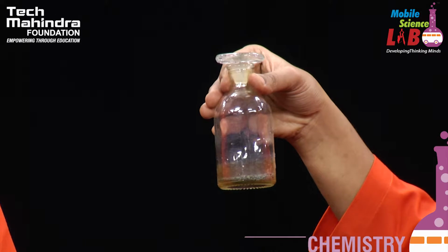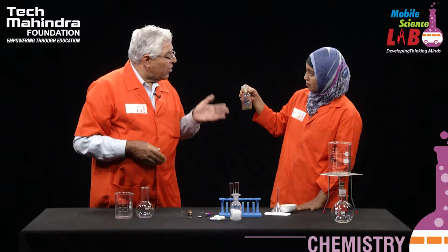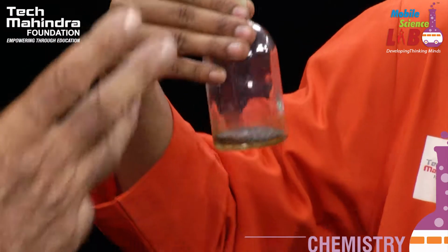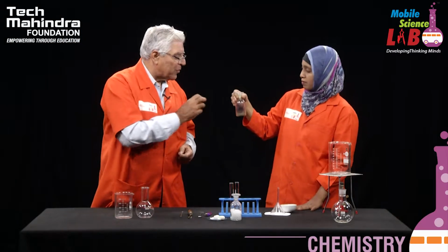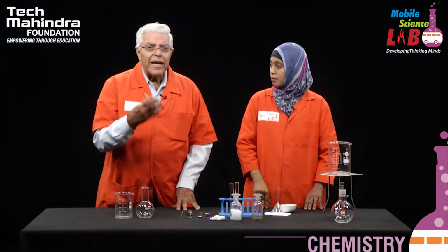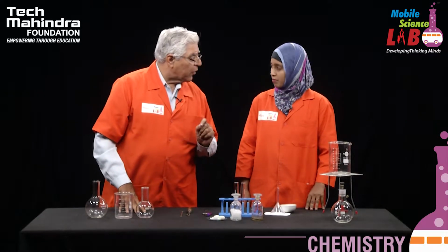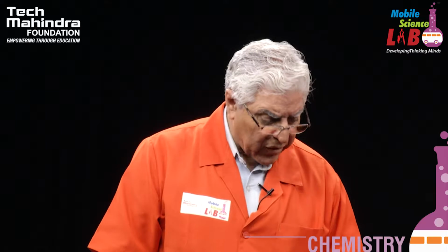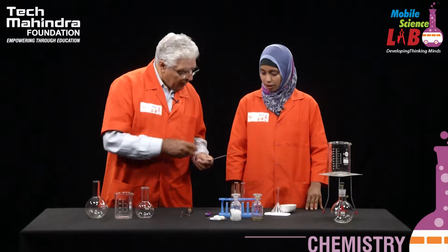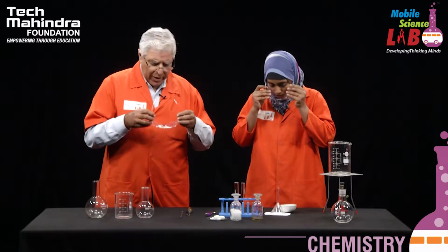Iodine is a shiny crystalline looking material, but it is actually capable of subliming, that means turning into a vapor. So first we will do an experiment with this, taking a very small quantity of iodine. When you heat it lightly, you will see what happens. We will do our first experiment of sublimation with iodine. With the help of this spatula, put a very small quantity of iodine into a test tube. But first put on your safety goggles, sir, because there will be quite a lot of vapor coming out.